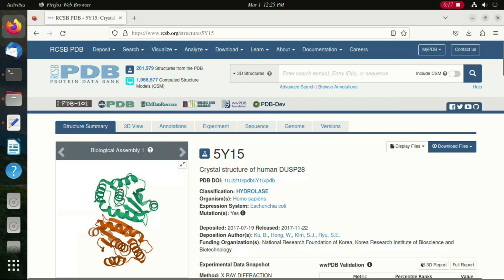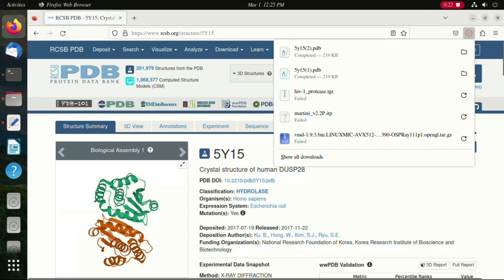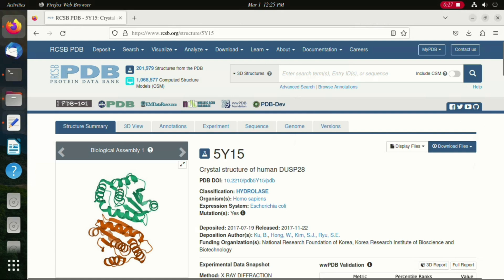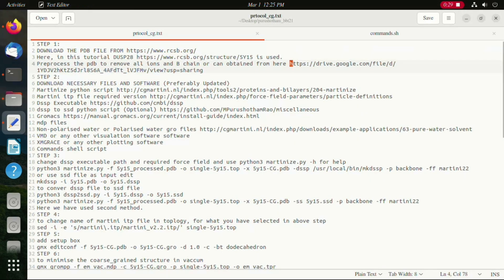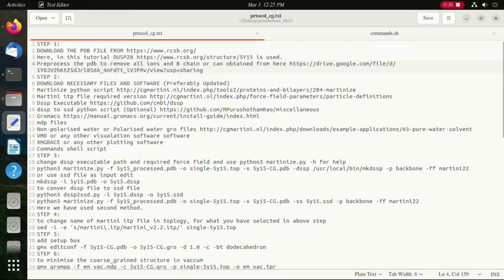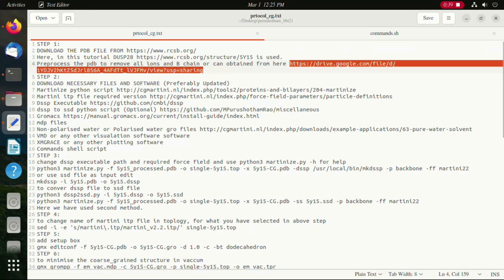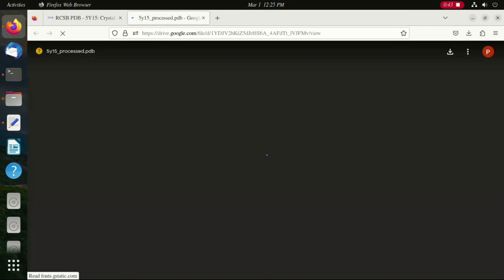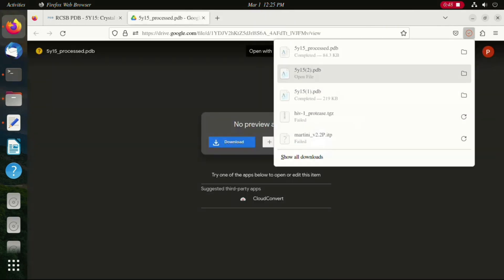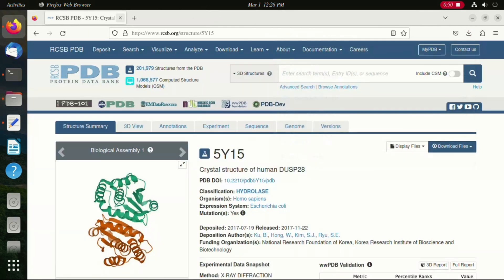In the process we are downloading the protein structure. From the link shared, you can obtain the Martinize Python script, which is available along with the Martini 2.2 ITP file. We also need to download the DSSP executable file and install it.